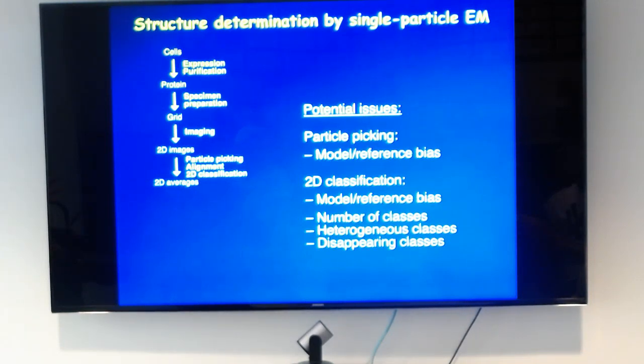So who of you actually uses RELION? Not yet, I will. You will. Okay, who is or is planning to use RELION? RELION is horrible with 2D classification. It's the worst program ever I've seen with 2D classification. The good thing, it doesn't matter anymore.